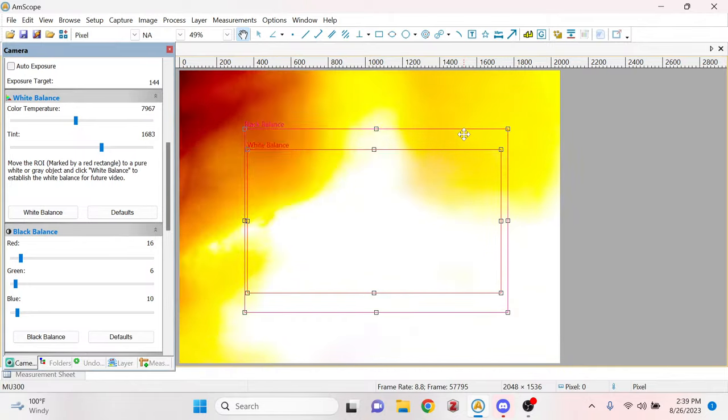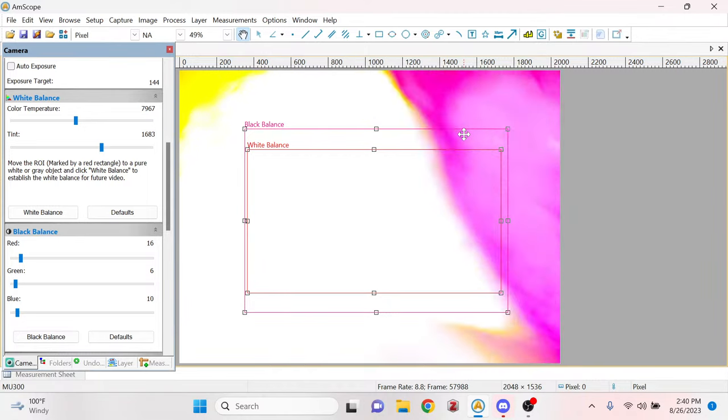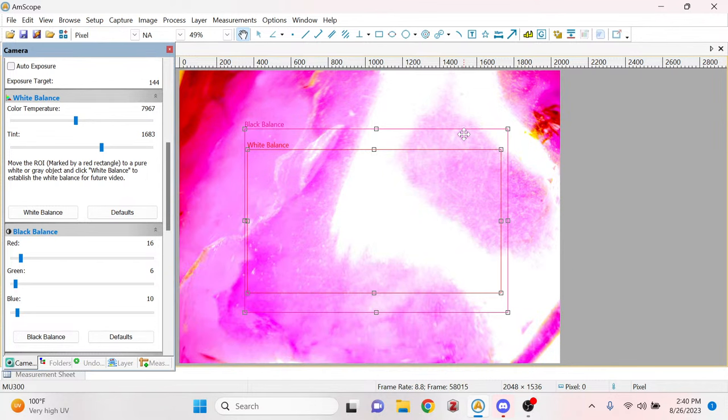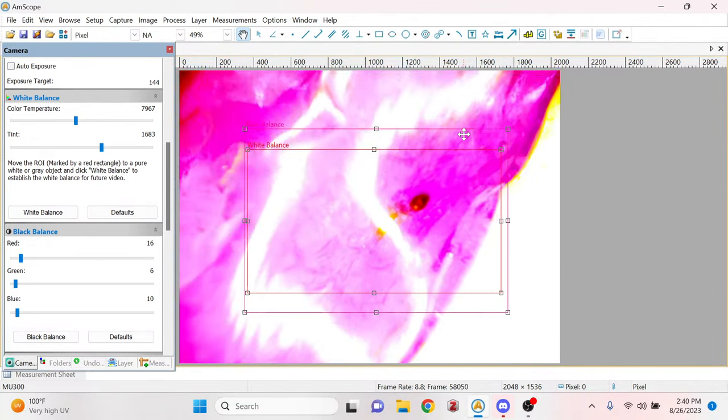Let's try one more piece of amber. This one is an ant from the Eocene, 55 million years old, from Kaliningrad. So this is Eastern Europe. There you are.